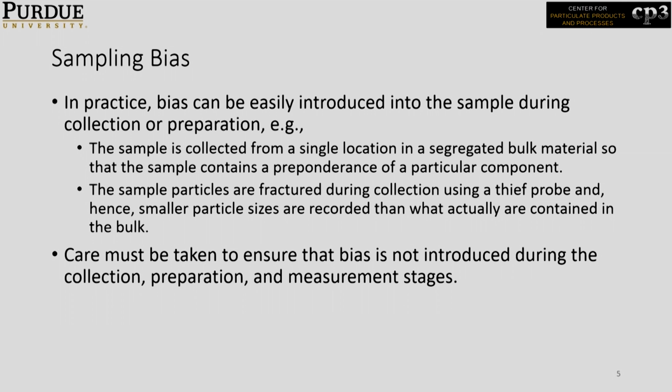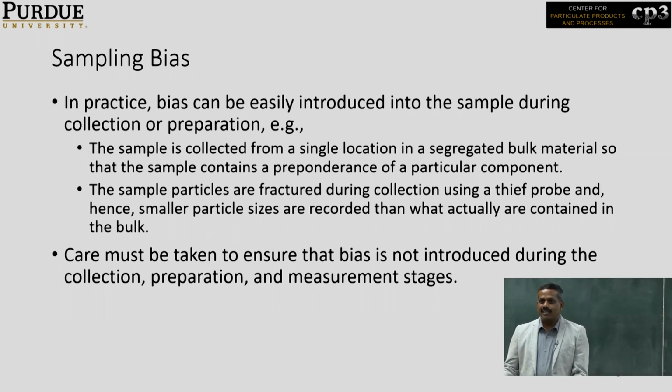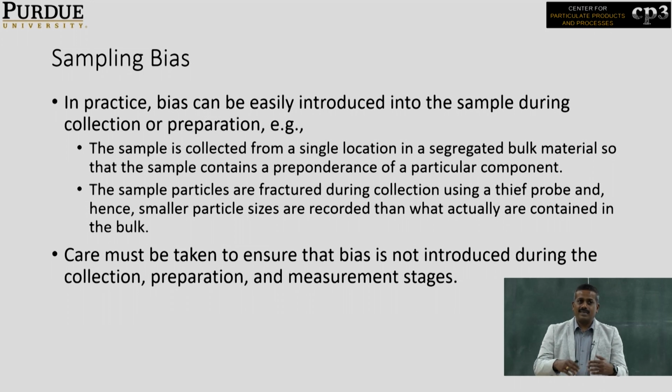So when you are taking 1 gram, you said you're mixing rice and picking a subsample, right? Rice is a free flowing material, so if you mix, they segregate. That again leads to some challenges in subsampling, because you will be sampling a segregated mix. If you are using a spatula, then again you are sampling an already segregated sample. If you are taking from the top, it's already segregated, so you are not getting the property of the exact mix of the powder.